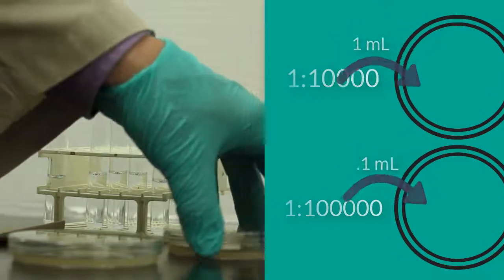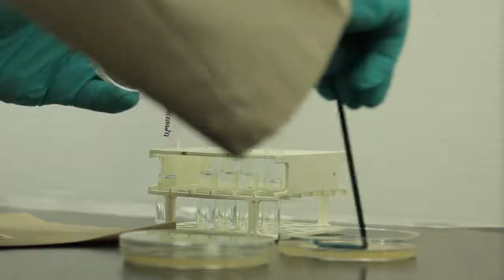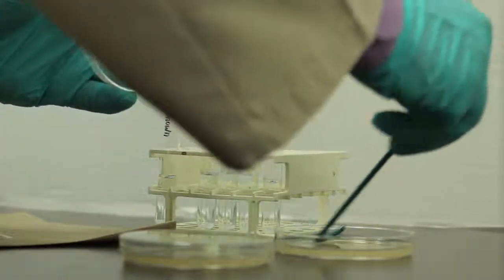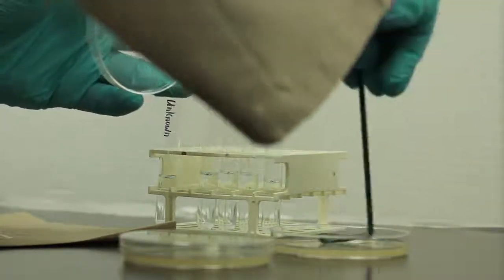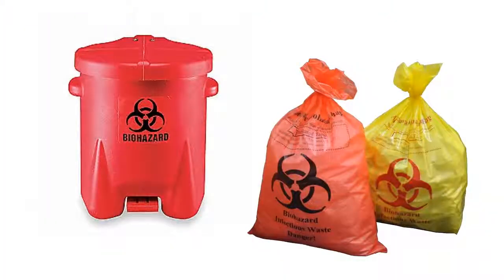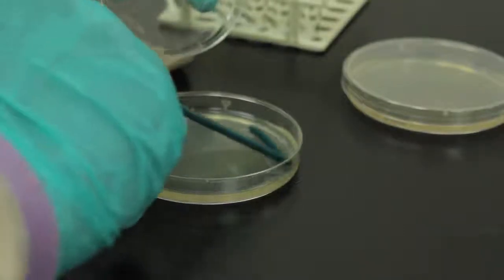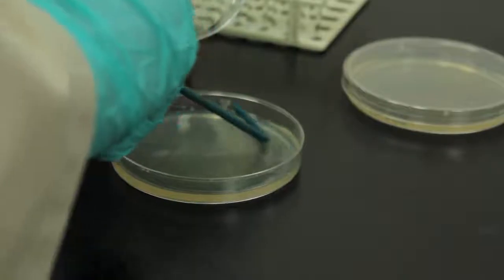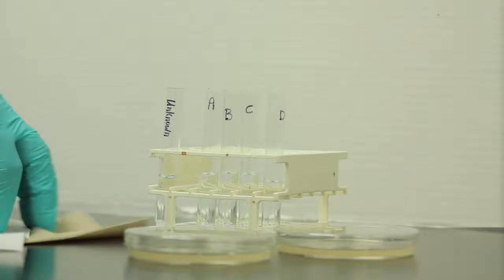Next, we're going to use the spread plate method, and we're going to spread those cells around the plate as evenly as possible. Make sure you touch the sides with your L-shaped spreader and go all around the plate several times. L-shaped spreaders are, of course, a biohazard and should be disposed of in the biohazard non-sharps. I'm going to use a separate L-shaped spreader for my next plate because I have two separate concentrations. Again, once I have spread those around evenly onto the plate, I'll dispose of this in the biohazard non-sharps.